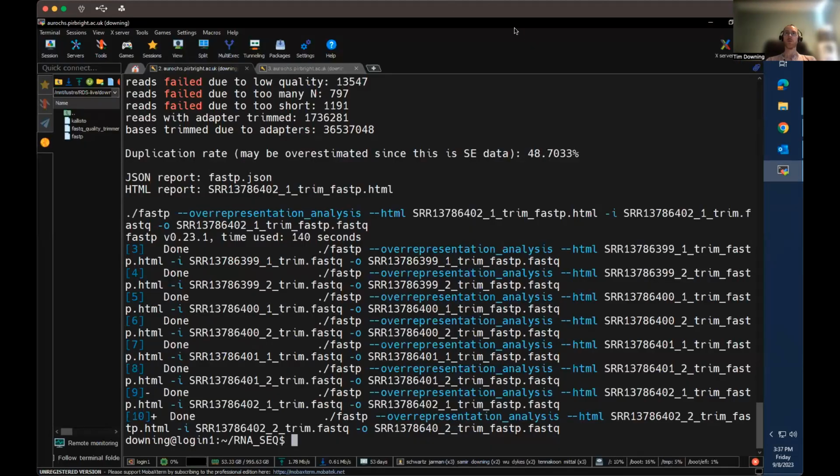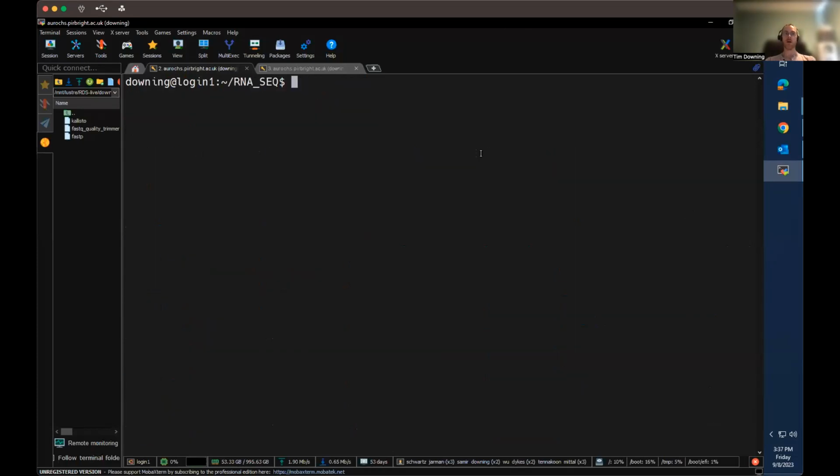files. So what we can do is take that sample again, and we're just going to run FastQC on our final samples. And you do this for all 10, underscore trim, underscore fastp, so we have it named appropriately on the FastQ file like that. So if we run that, we'll read that in and we'll generate an HTML and zip file again for that file.